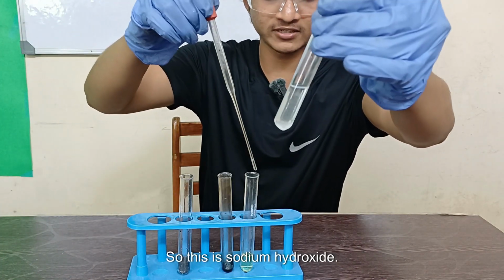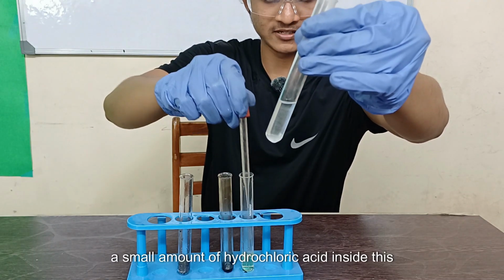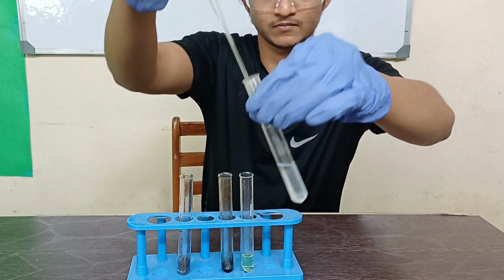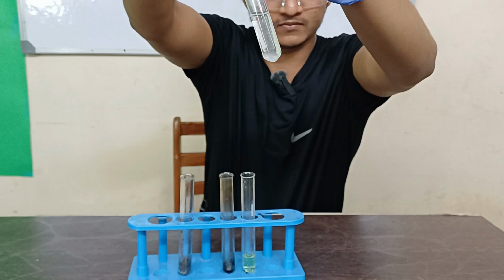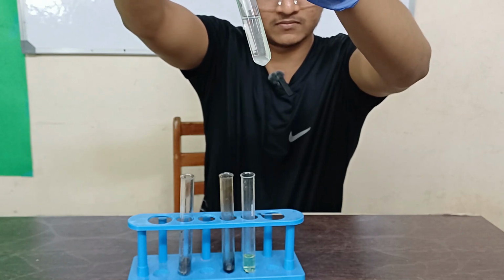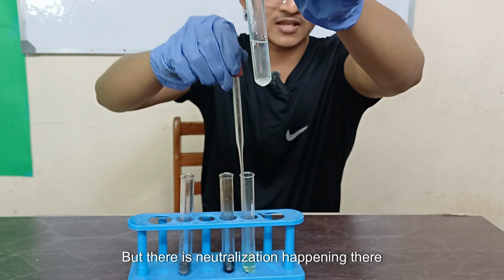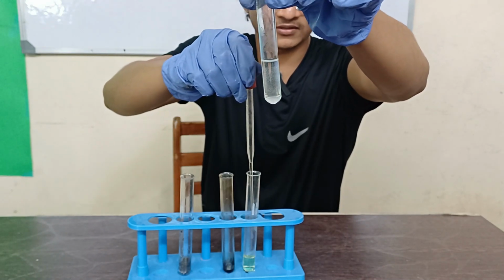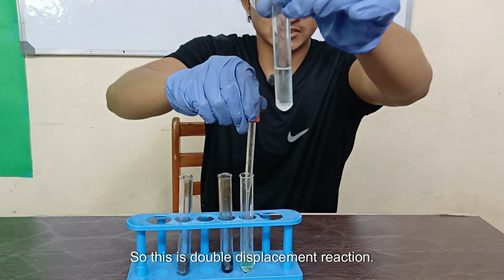So this is sodium hydroxide. I'm going to take a small amount of hydrochloric acid inside this pipette and I'm going to add it into this test tube. There isn't much reaction though. There isn't much reaction, but there is neutralization happening there, and there is exchanging of ions taking place. So this is double displacement reaction.